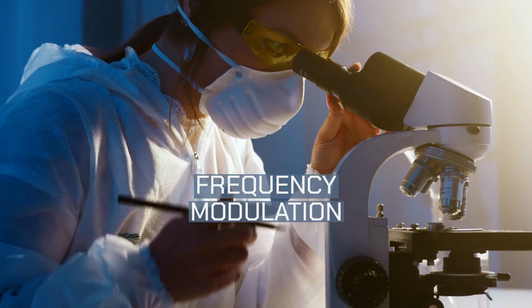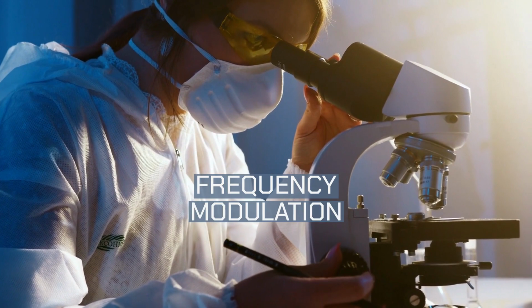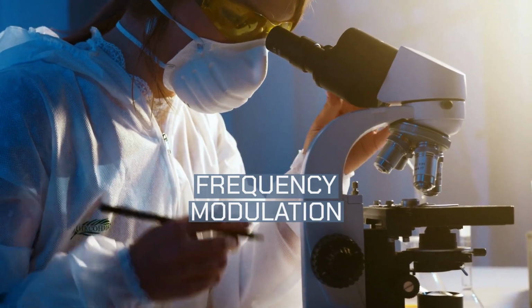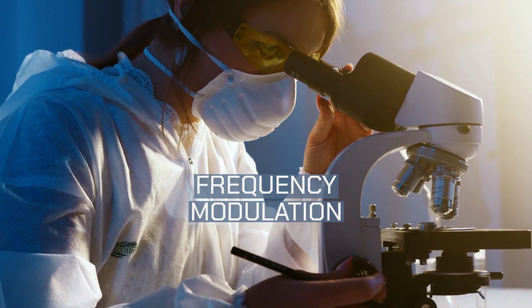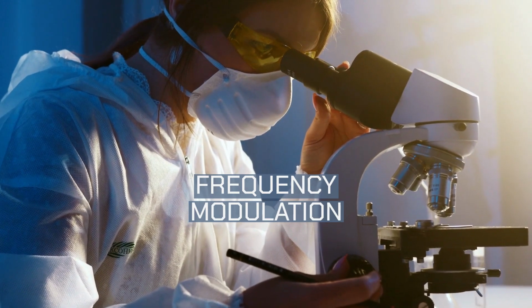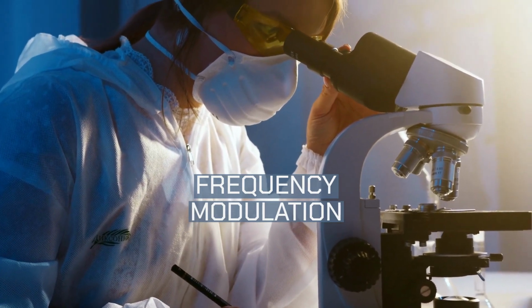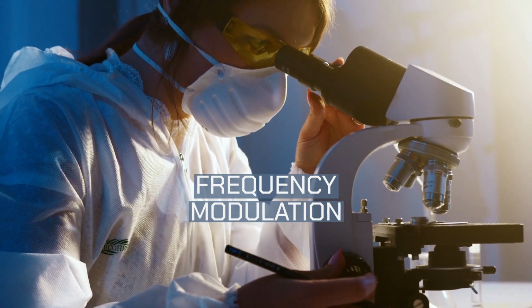Frequency modulation atomic force microscopy, introduced by Albrecht, Grütter, Horne and Rugar in 1991, is a mode of nc-AFM where the change in resonant frequency of the sensor is tracked directly by always exciting the sensor on resonance. To maintain excitation on resonance, the electronics must keep a 90 degree phase difference between the excitation and response of the sensor. This is either done by driving the sensor with the deflection signal phase shifted by 90 degrees, or by using an advanced phase-locked loop which can lock to a specific phase.